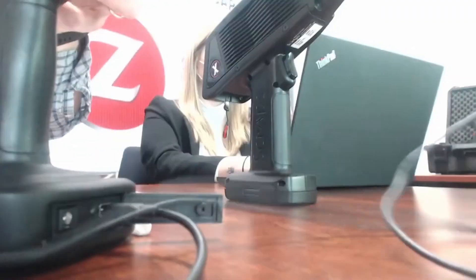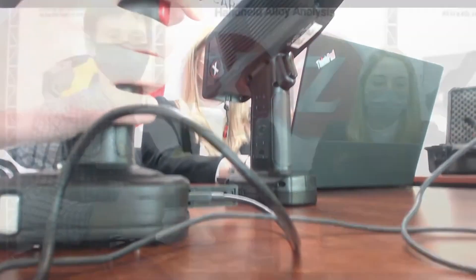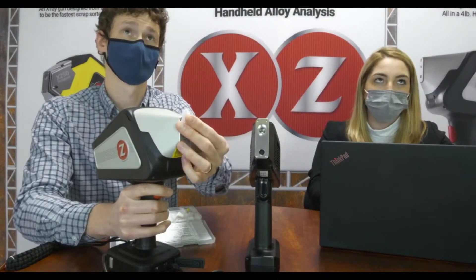I'll just show you a quick demonstration of that Element Pro software. I'm going to take a test — I'm holding the sample in front and I'll pull the trigger. That loud snapping you heard is actually the laser hitting the sample and creating a plasma.